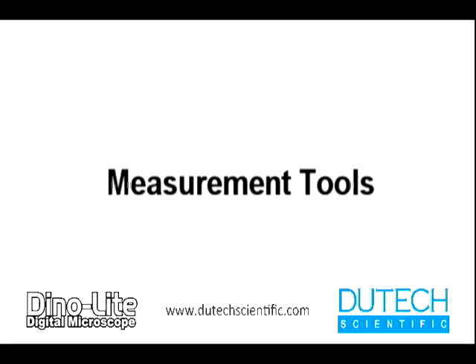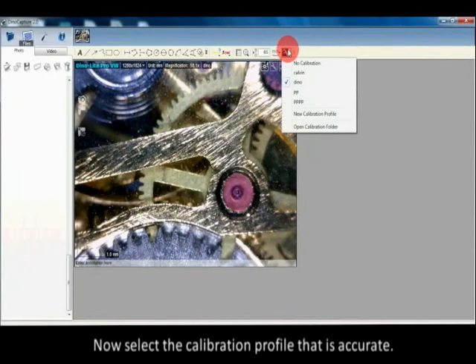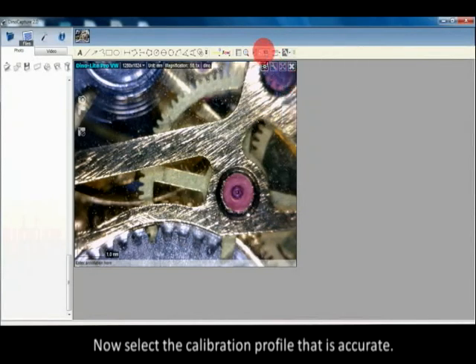Measurement tools: Now select the calibration profile that is accurate.